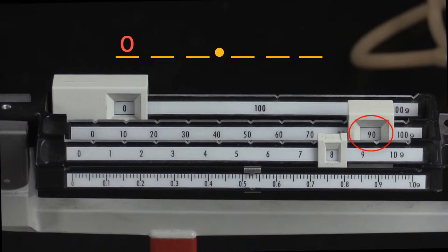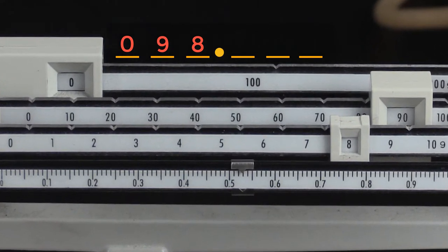Next we move to the tens place. The slider is in the 90 slot, so there is a nine in the tens place. We do the same for the ones place beam, and we see that it is in the eight slot. So we put an eight in the ones place for our measurement.